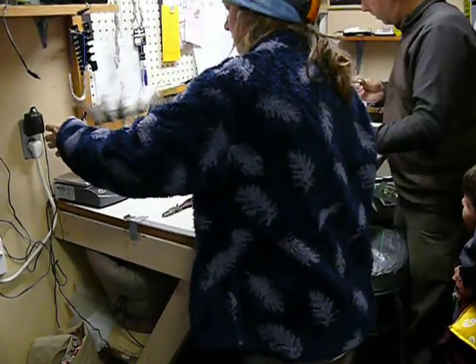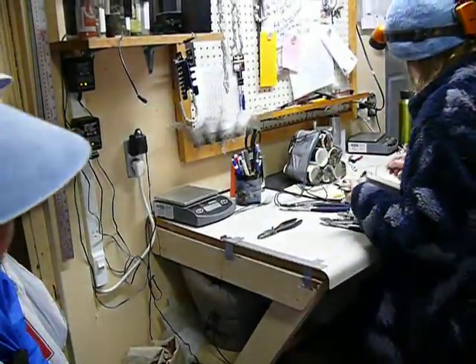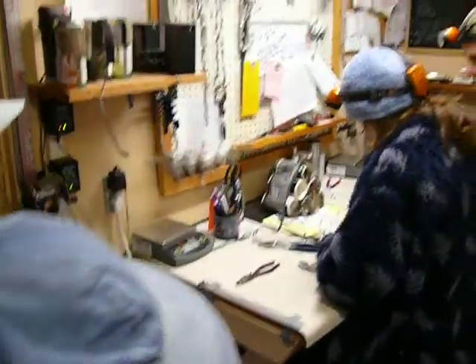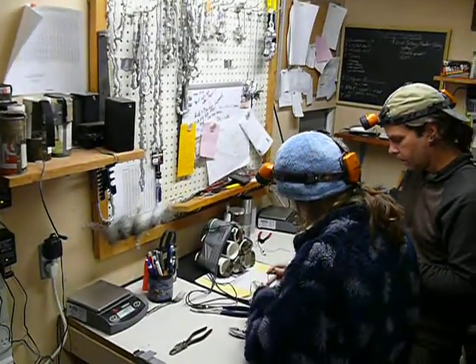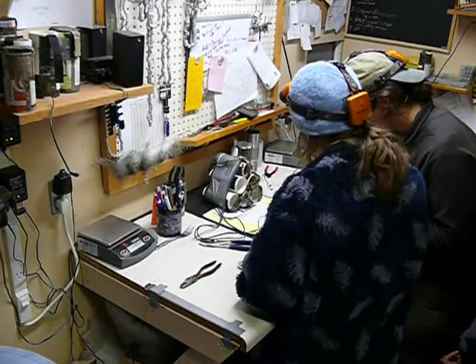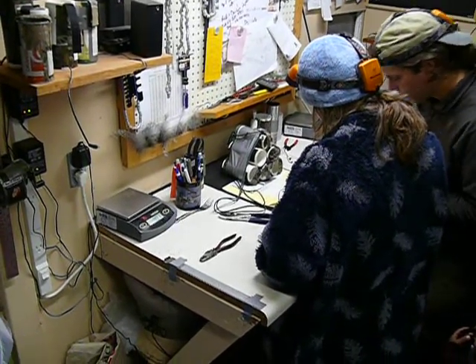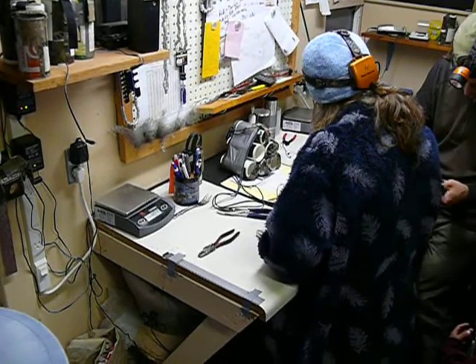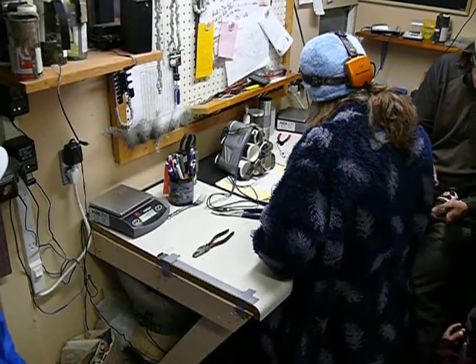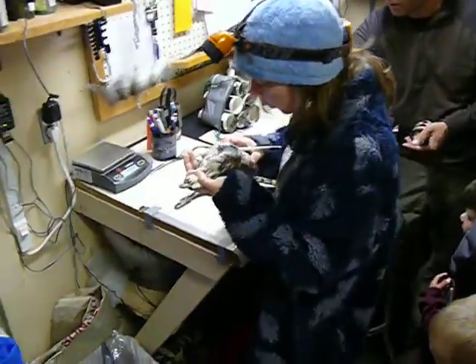Then we weigh them. It's a metal band — he's got a unique code. So if they ever capture him somewhere else, they can identify him. It's an individual number — only one bird has that number.